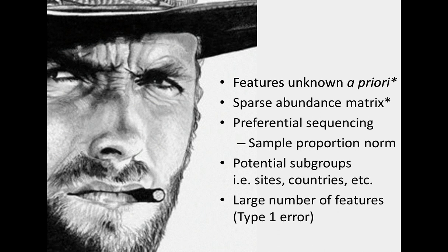And that's partly because features being the taxa, the bacteria, they're unknown a priori. Often you're doing this OTU clustering, right? It's based off of read similarity. And these bacteria are not necessarily within the databases, okay? And there are other issues, like I said before, that particular OTU matrix that I analyzed with the Gates Foundation, you can download it from Bioconductor right now, and 98% of the values in that matrix are 0.